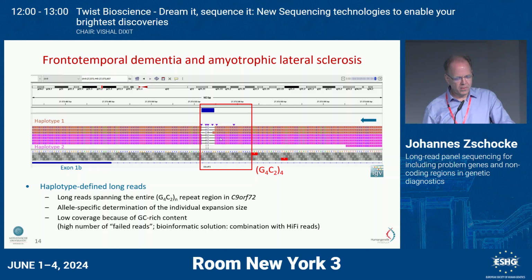So we can say this is homozygous, but we have two different haplotypes, so they are biallelic, so we can say it is normal. I do not believe that we would be able to detect large expansions, because PacBio is shorter than Oxford Nanopore, and we have shorter reads, but we can recognize the normals, and if it's abnormal, go on and say, let's go for some other method.